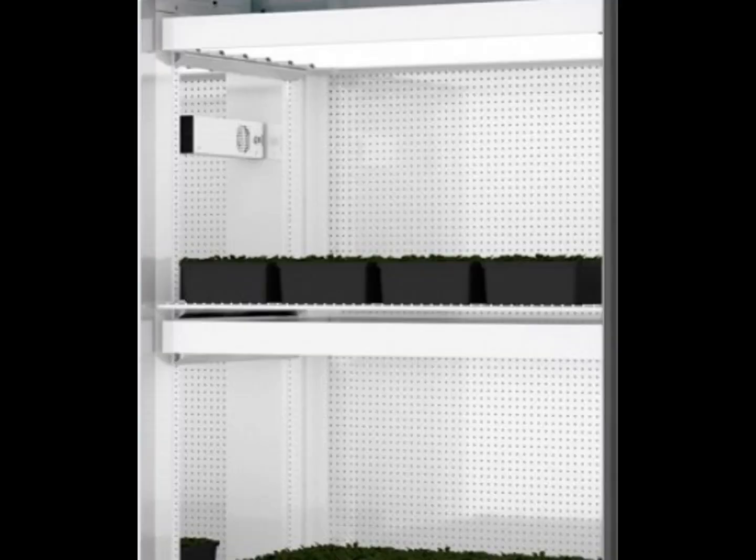Alright, now to the part that you all have been waiting for, opening the chamber. I did not film opening the chamber because there are some very, very bright fluorescent lights that are going on in there, and having your bare eyes exposed to them can be very harmful. And I also did not want to interrupt an ongoing experiment. However, I did come back and finesse some pics of the chamber inside.